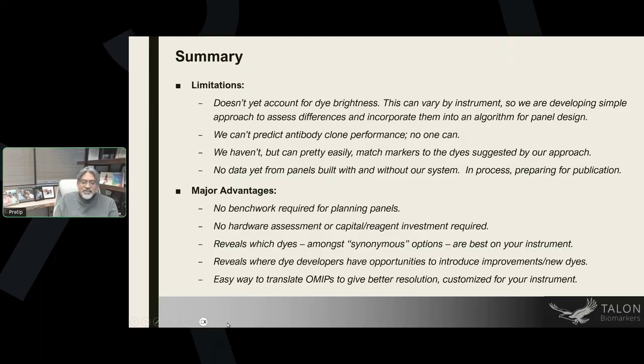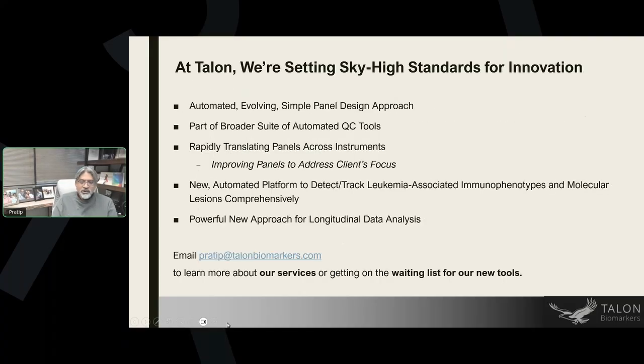We reveal where dye developers have opportunities to introduce improvements or new dyes, and this is an easy way to translate OMIPs to give better resolution that's customized for your particular instrument.